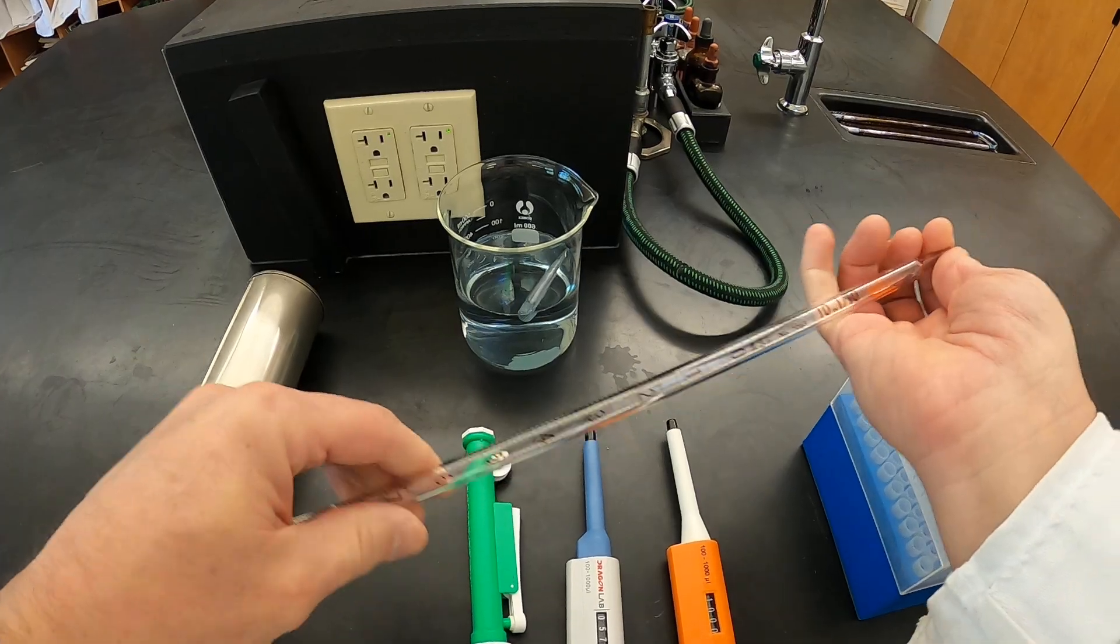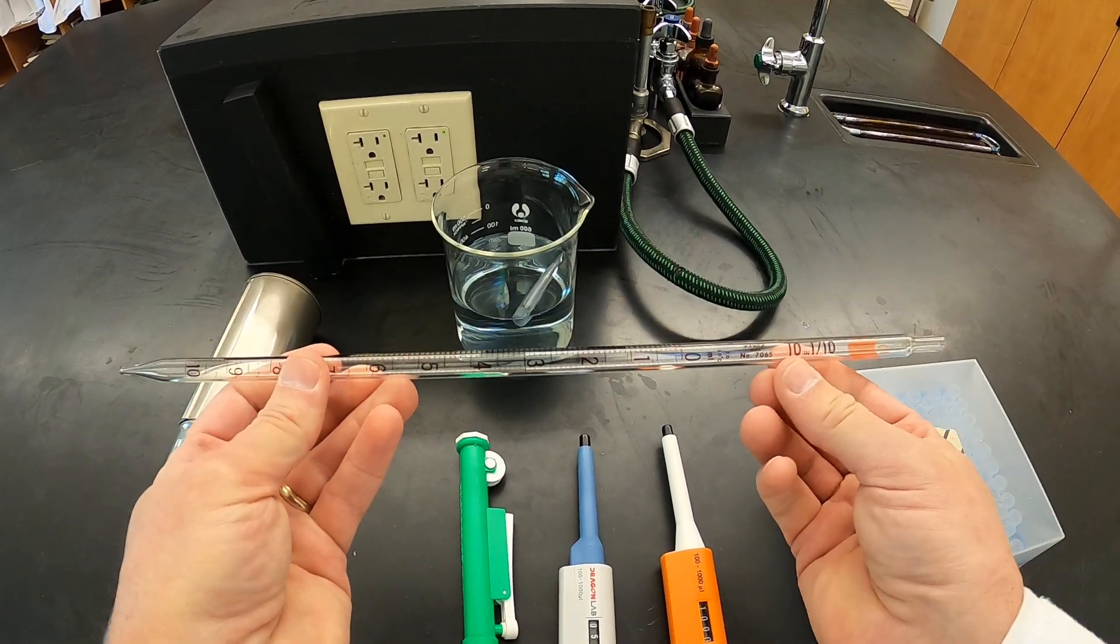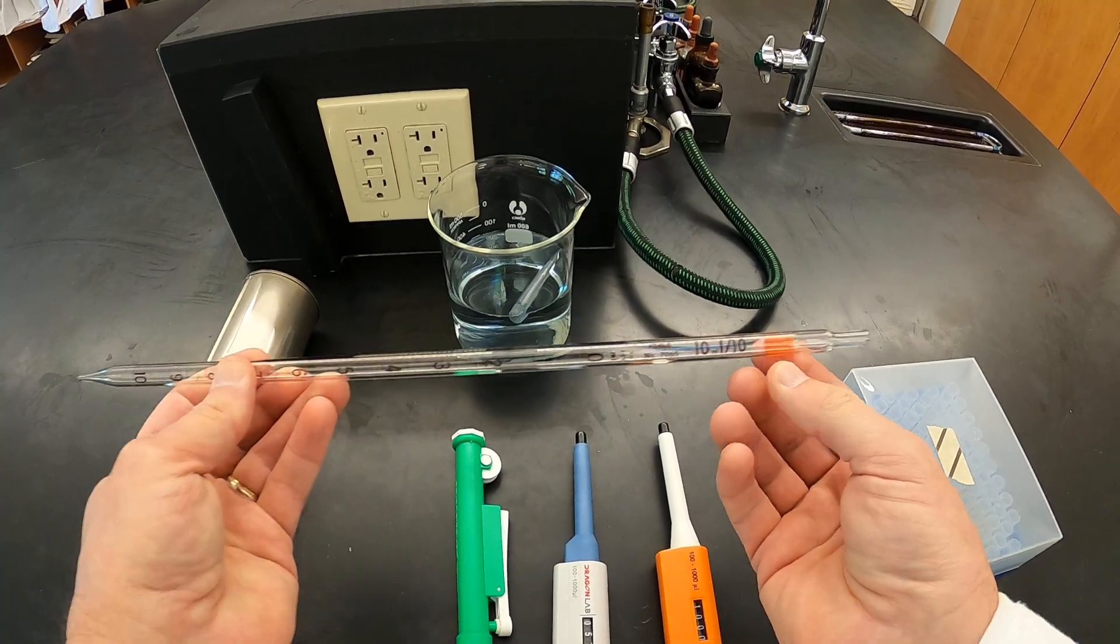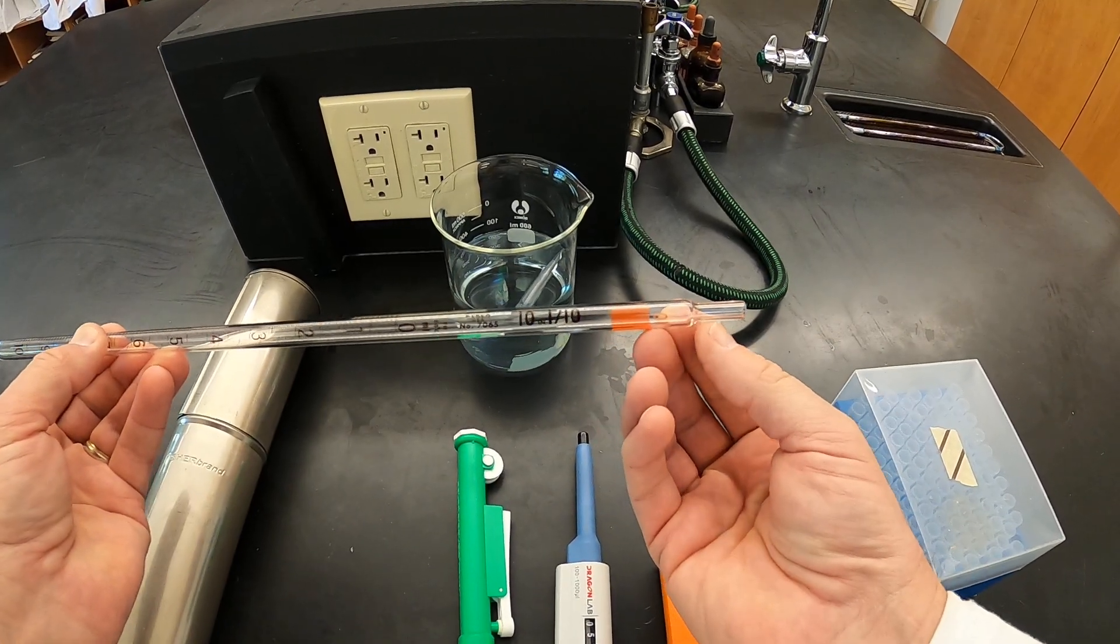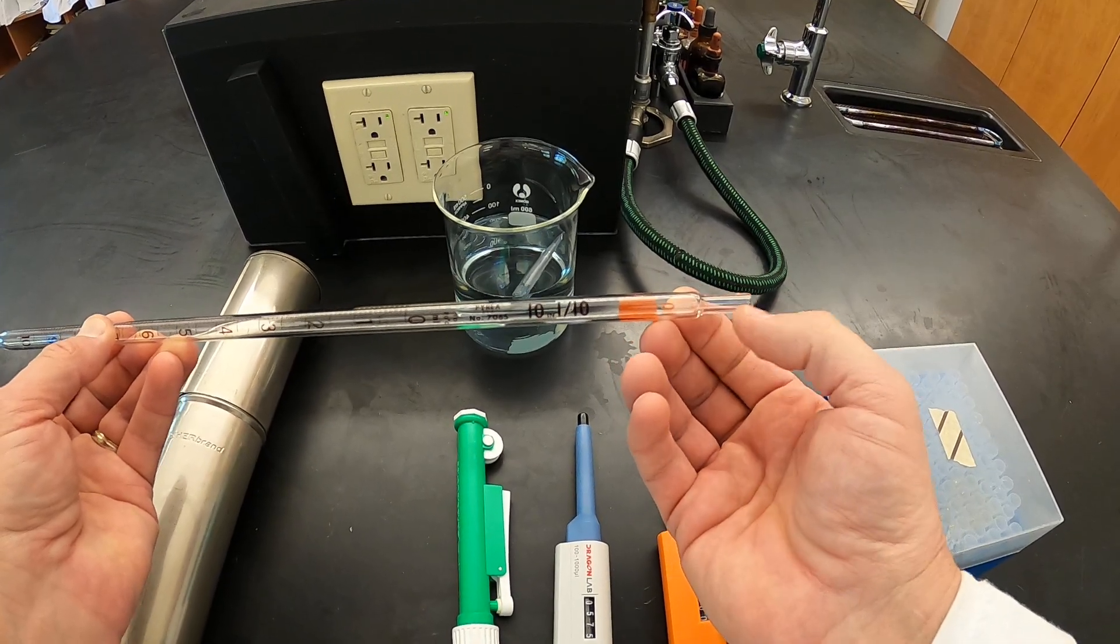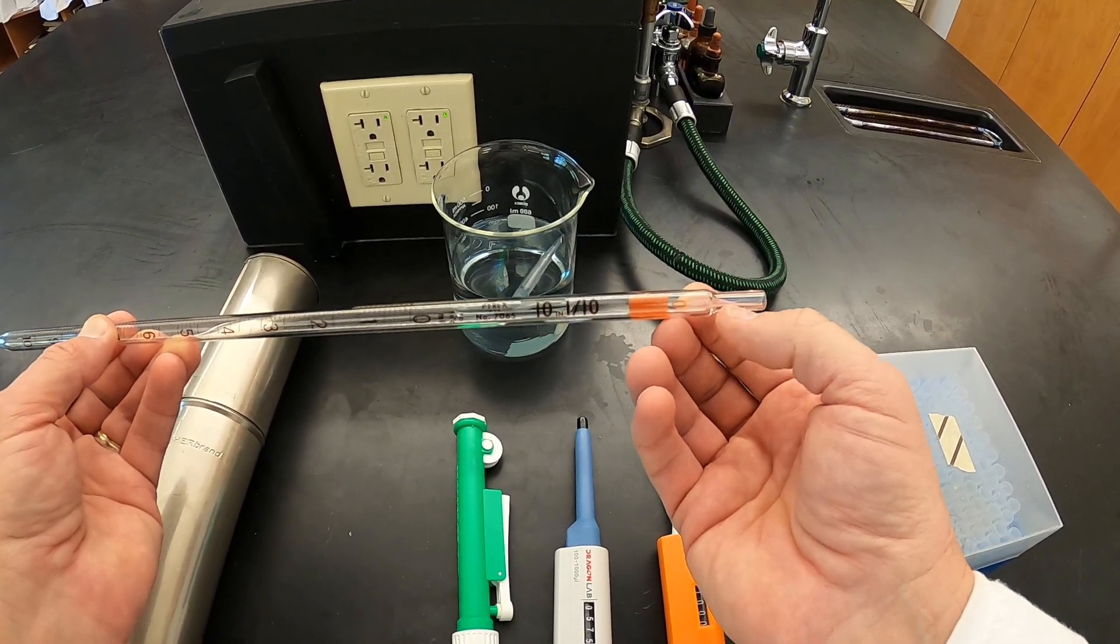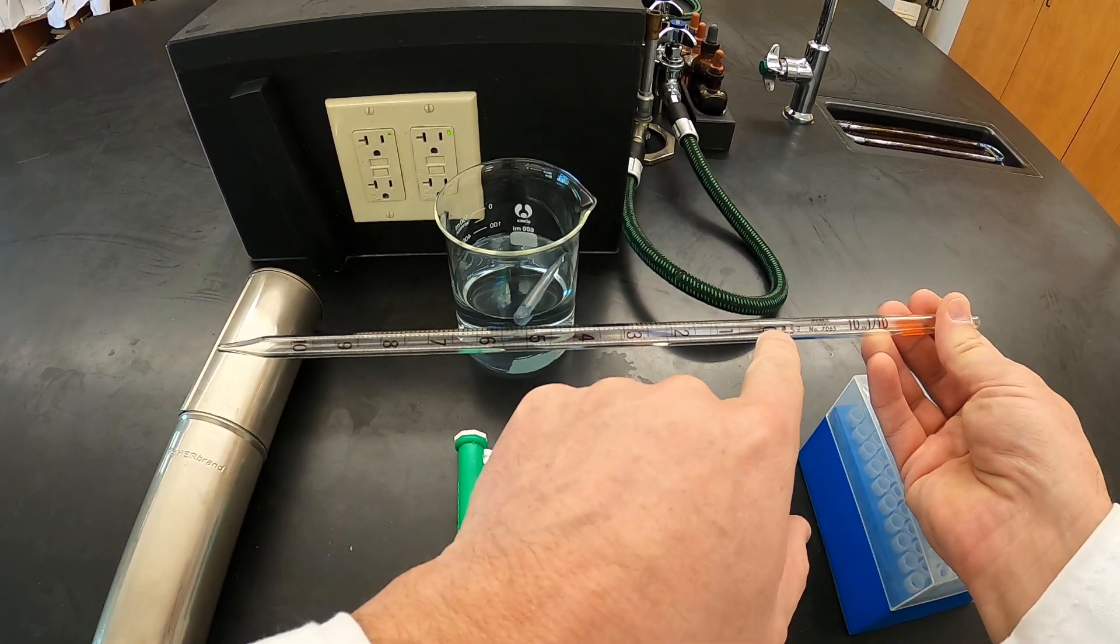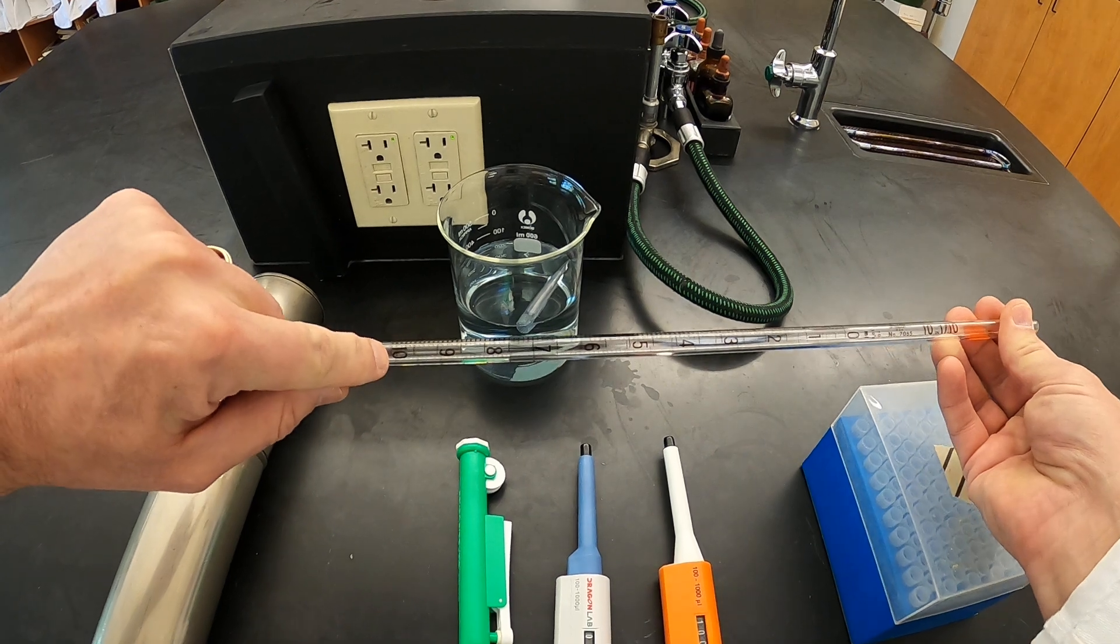And this pipette is also a 10 milliliter pipette, and it's accurate to one-tenth of a milliliter. Notice there's no etchings and no colored bands here at the top. This one also doesn't have a cotton plug. Sometimes they will and sometimes they won't. You'll notice here that it goes from zero to 10 milliliters there.